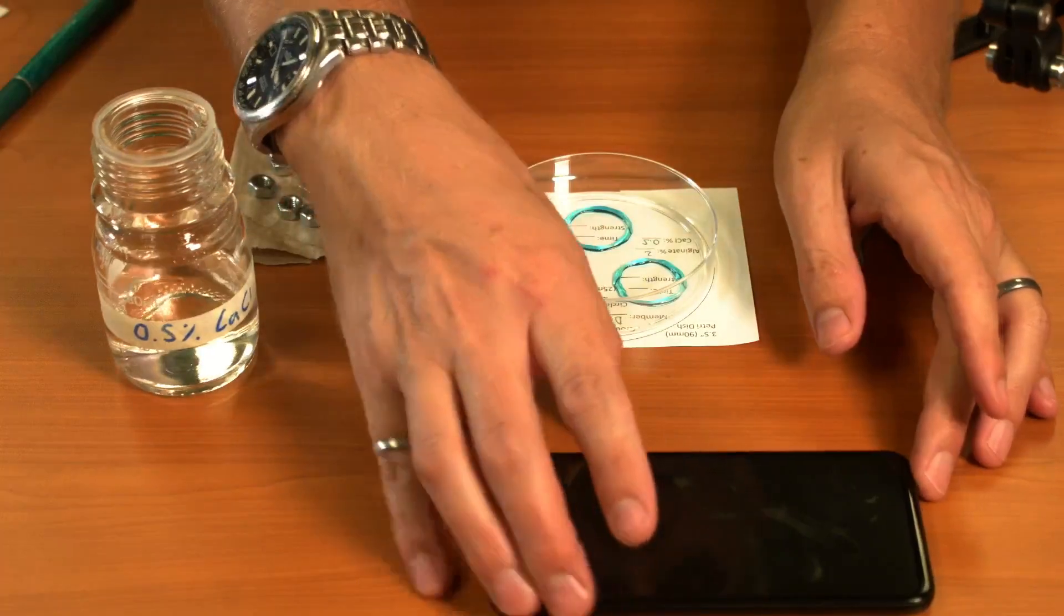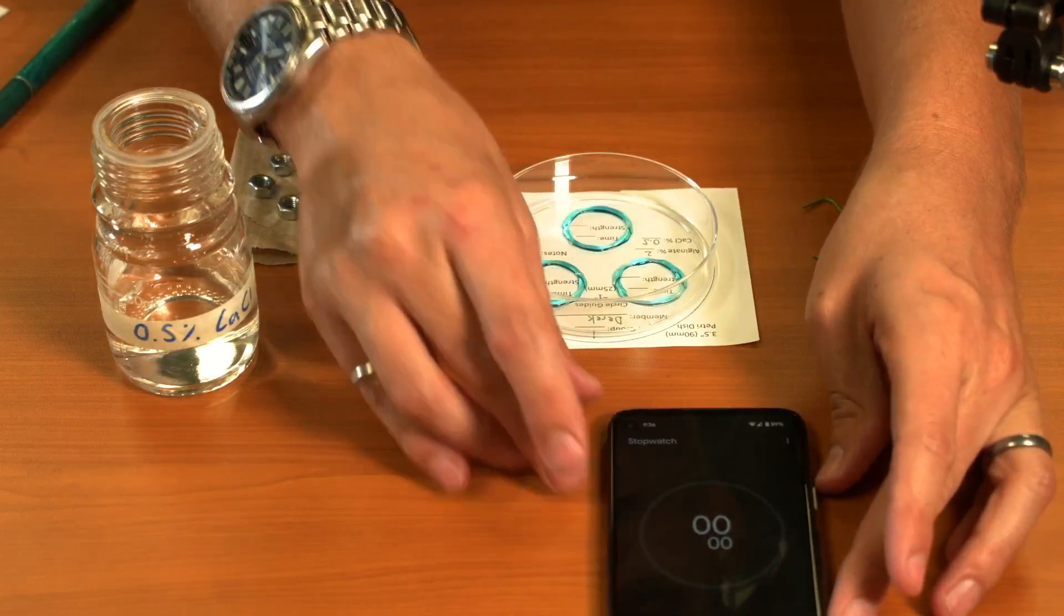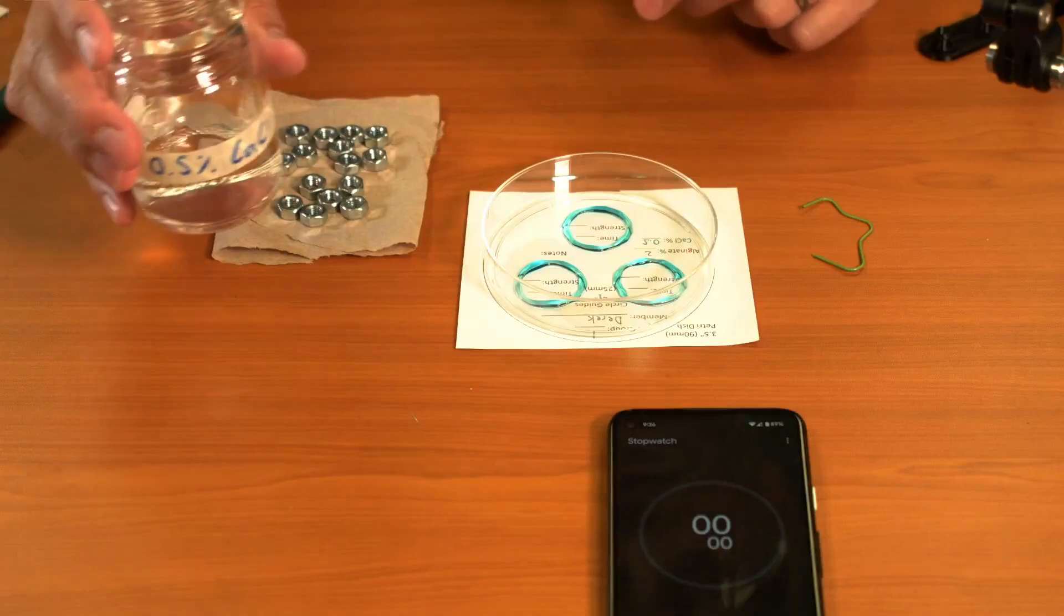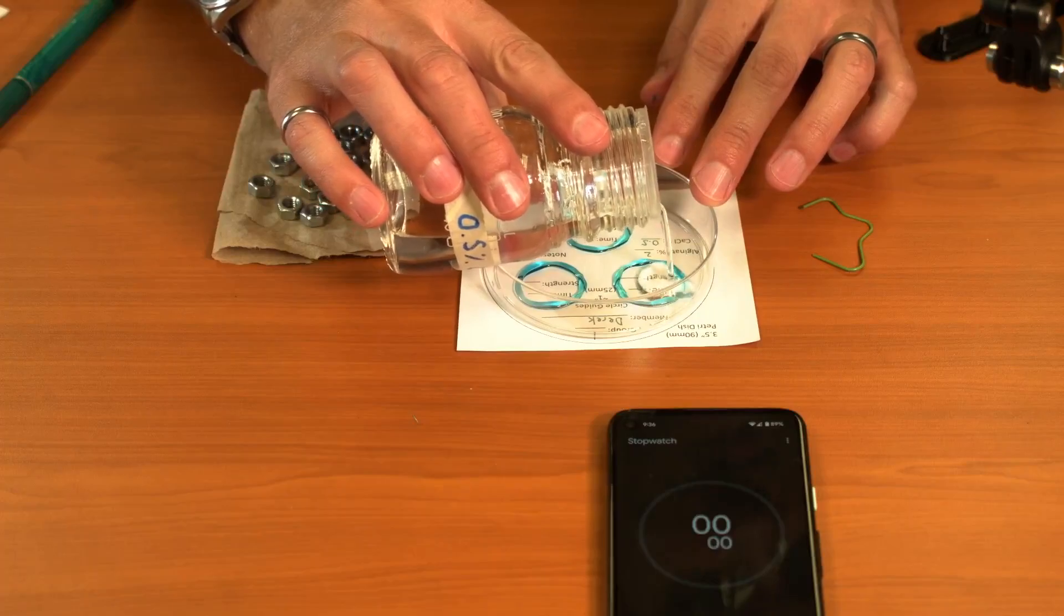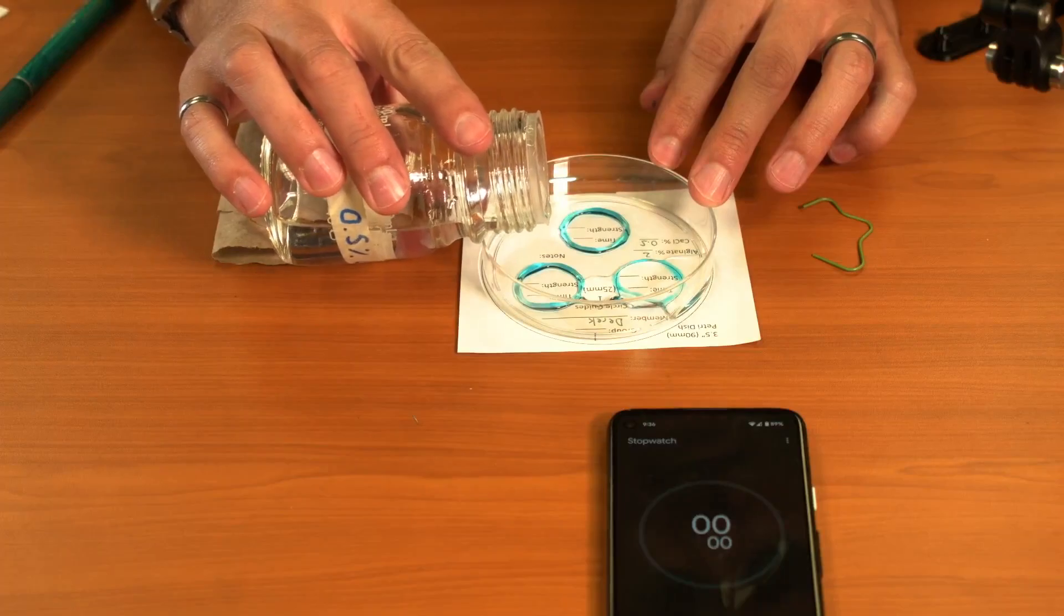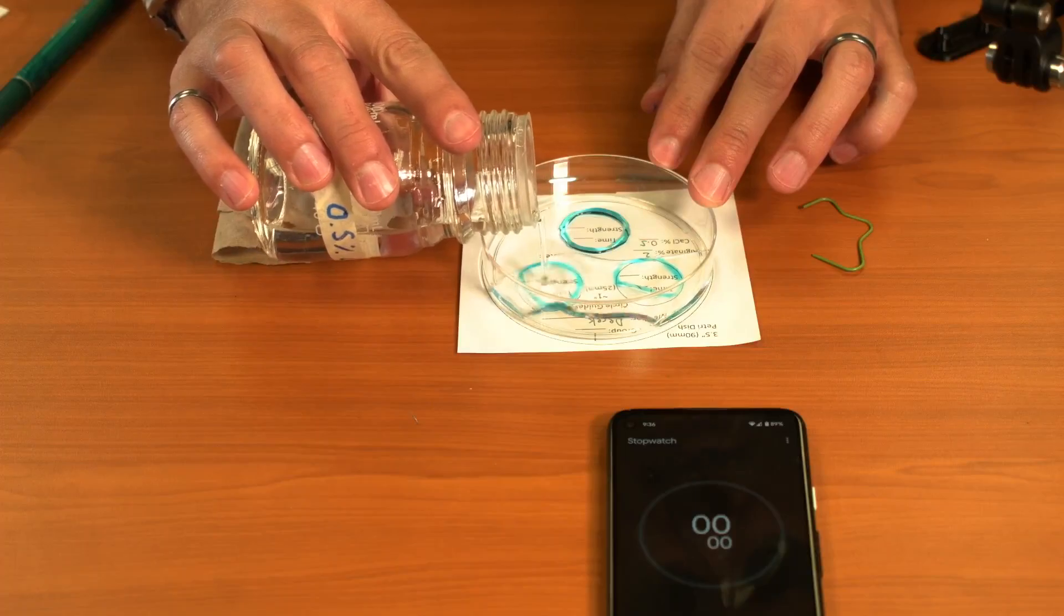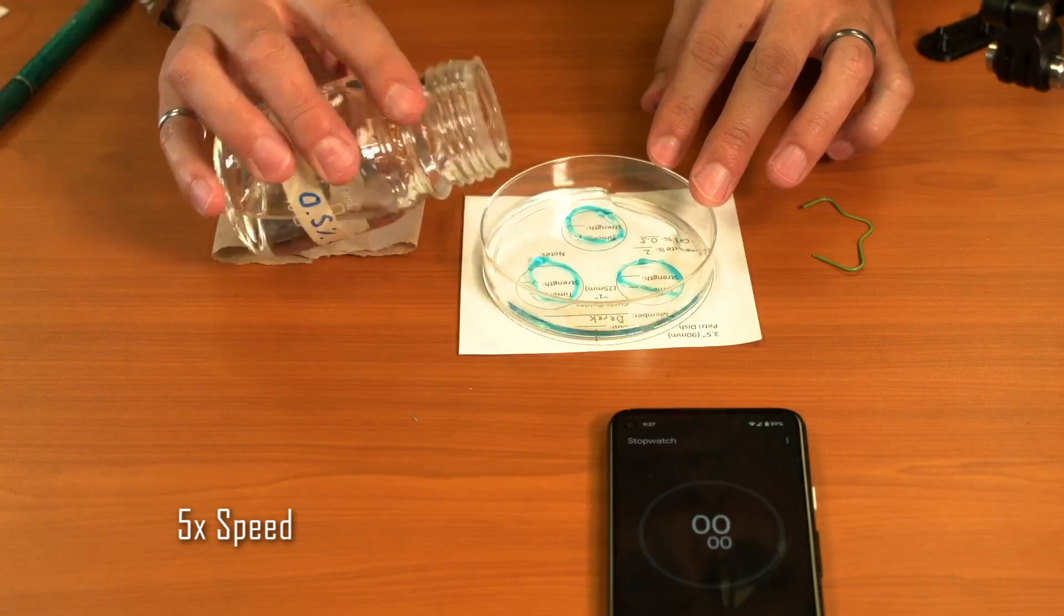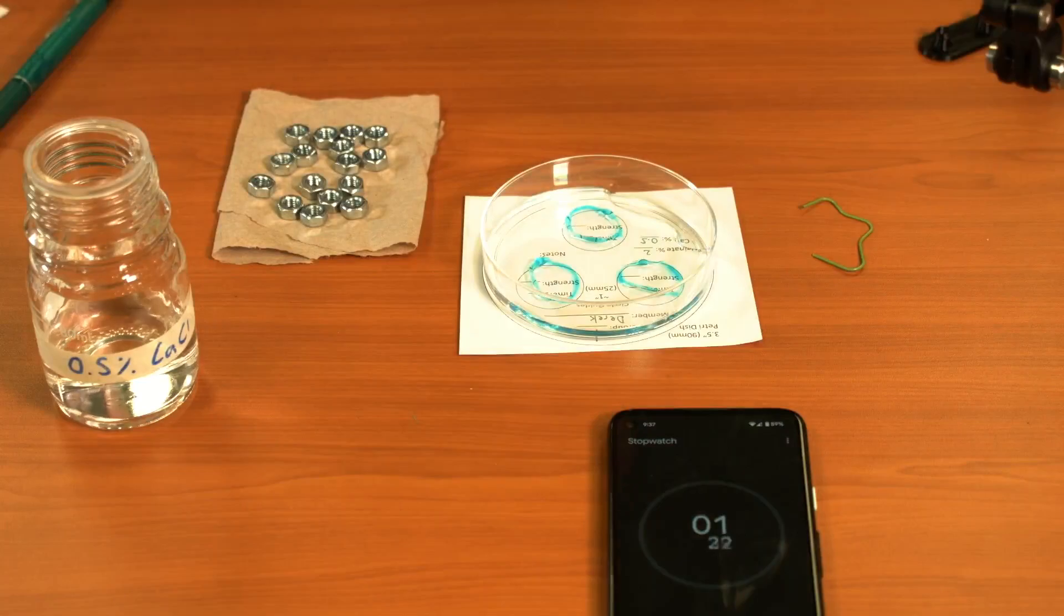I'm going to get my timer ready and then carefully pour some of my calcium chloride on top of my rings. I'm going to pour it close to the middle of the ring. I just want to get enough to cover the ring completely. I don't want to disturb the placement too much. You can see it's starting to float up in a couple of places, but I'm going to time this. I'm going to let it sit for one minute.